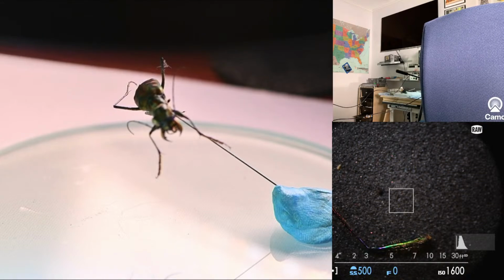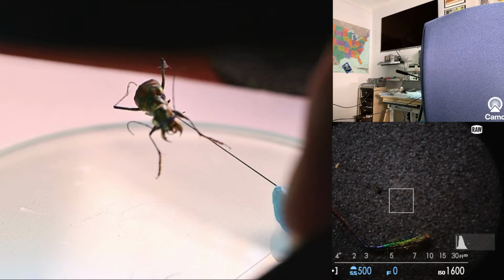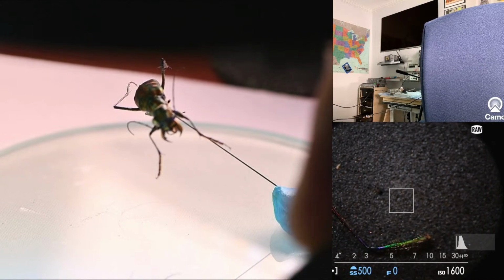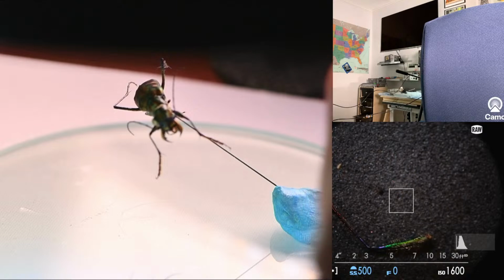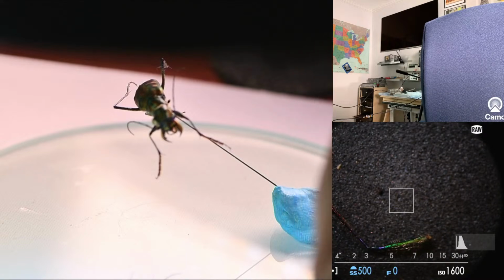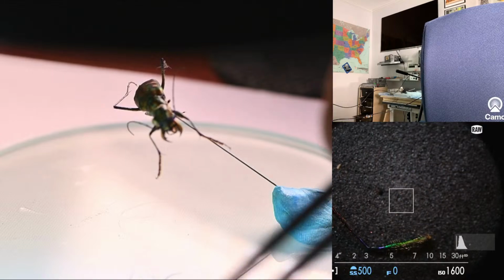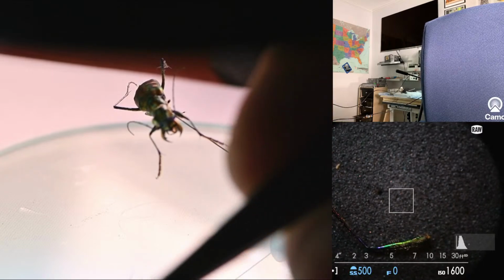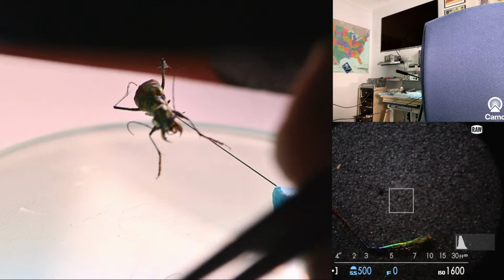This will remove material. So I've already done this, and let me just show you very quickly how I go about sharpening the tweezers. I take the tweezers and hold the points together like so, and I recontour the outside. That means with the 600 grit, I'll go from side to side on one side, then I'll turn it over, do the same on the other side, and then I'll do the same on both edges. And notice that I'm just gently holding the tips together. I'm not squeezing hard. That will create an outside profile on the tweezers that will be very effective for keeping the bulk of the end of the tweezers low.